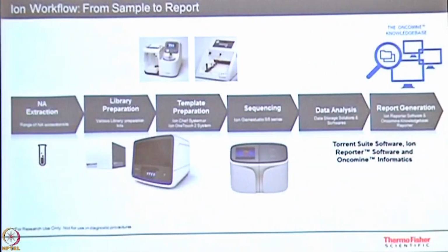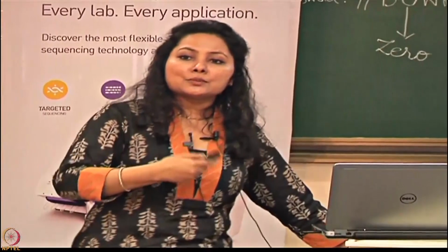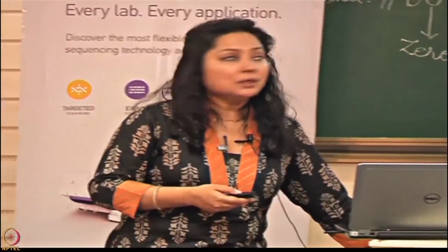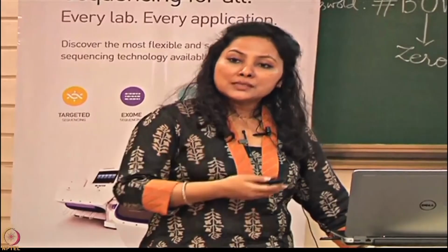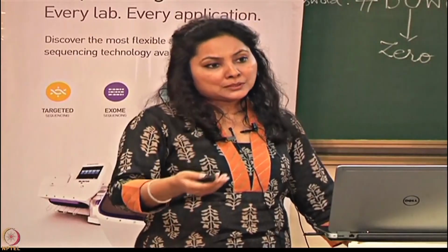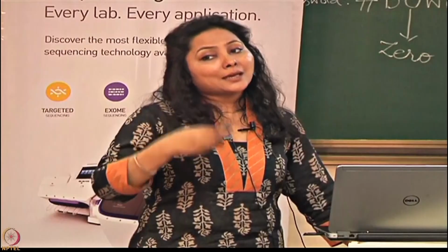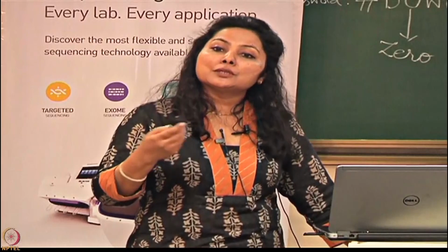Then comes template preparation. Now these are the things which are specific to a technology. In template preparation, you are taking these library molecules and amplifying them onto ion spheres. So we are talking about Ion Torrent technology, where we are using ion spheres as the mode. These ion spheres get loaded onto those chips, and finally these ion spheres are carrying those regions of interest, those library molecules from which you are generating all those reads.